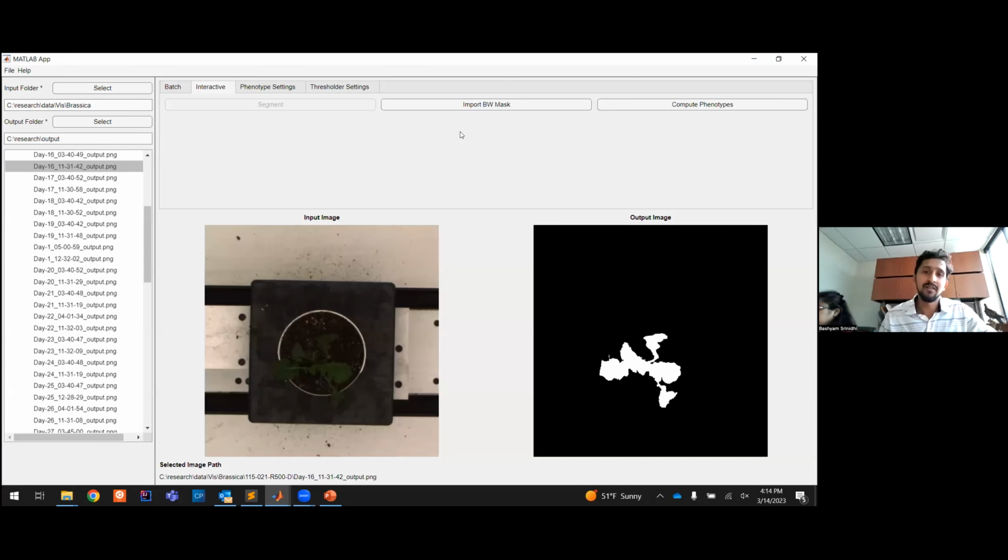This app will figure out where the images are exported, and it will import them when we click on the import button here. If you see on the right side, each leaf is stuck to each other. There is no gap. We did a good segmentation using the Segmenter app. If I import it, that should change. I imported it. You can see now the leaves are all separated. So it all looks good.